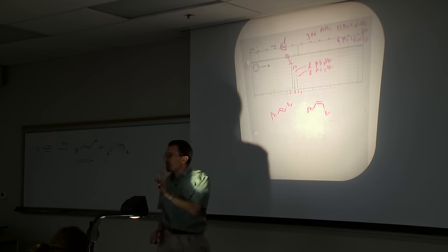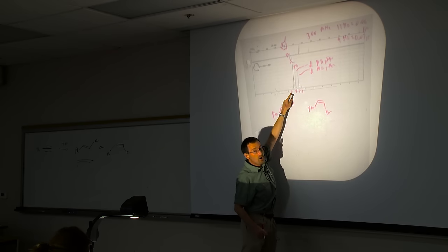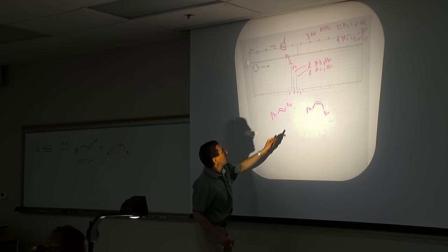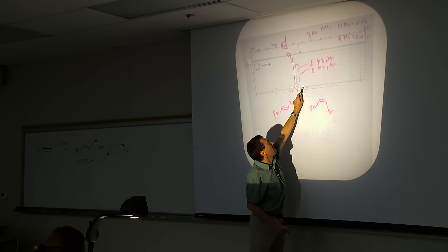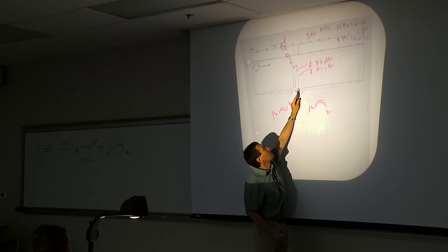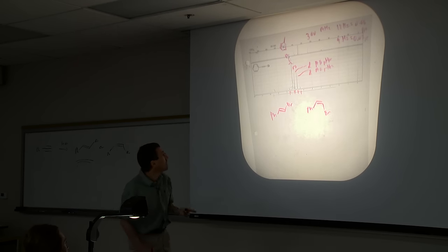And what really gives this away is we look here and we see another doublet and a mate over here for that doublet. And those doublets are far closer together. In other words, these doublets look like they're maybe 0.05 ppm apart. These look like they're maybe 0.03 ppm apart. These look more like they're, I don't know, 15 or 18 hertz. These look more like they're 10 hertz or thereabouts. And again, I would measure them if I had an actual spectrum that I wanted to work with.